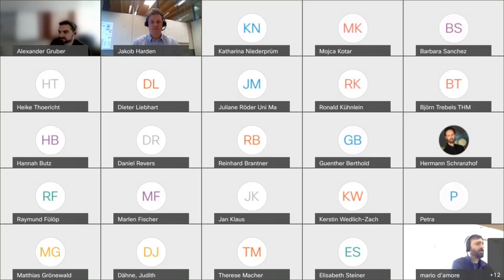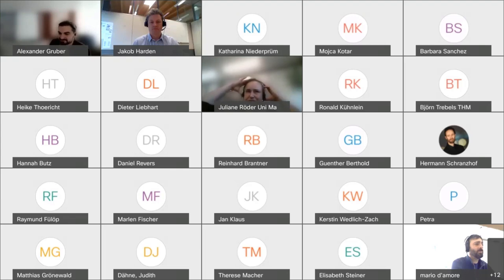Is there another question? Okay. Juliane, just unmute yourself. So I have a question about changing properties of samples or of items in bulk, like a certain number of items has been quality checked, and I don't want to put in that information for 20 lab items by hand, but I want to change that information in bulk. Is that possible?